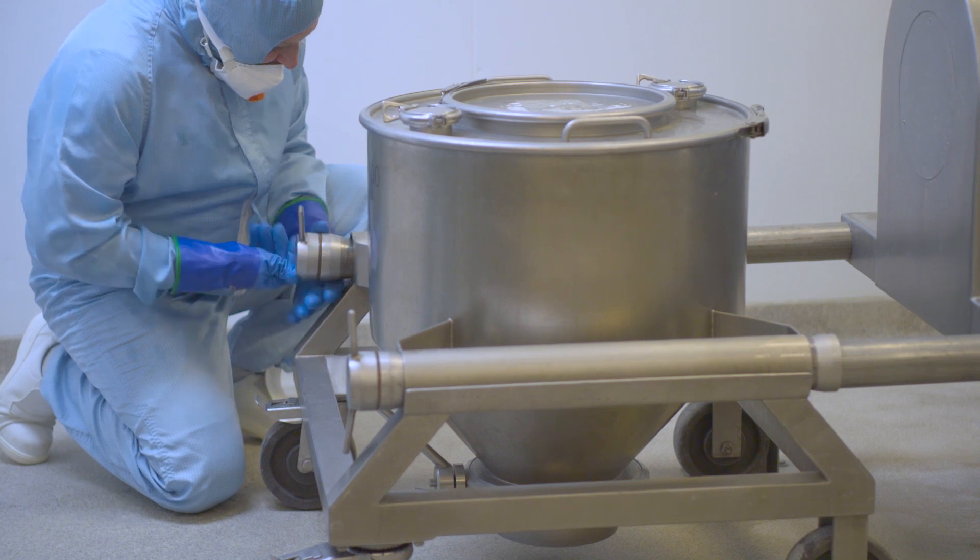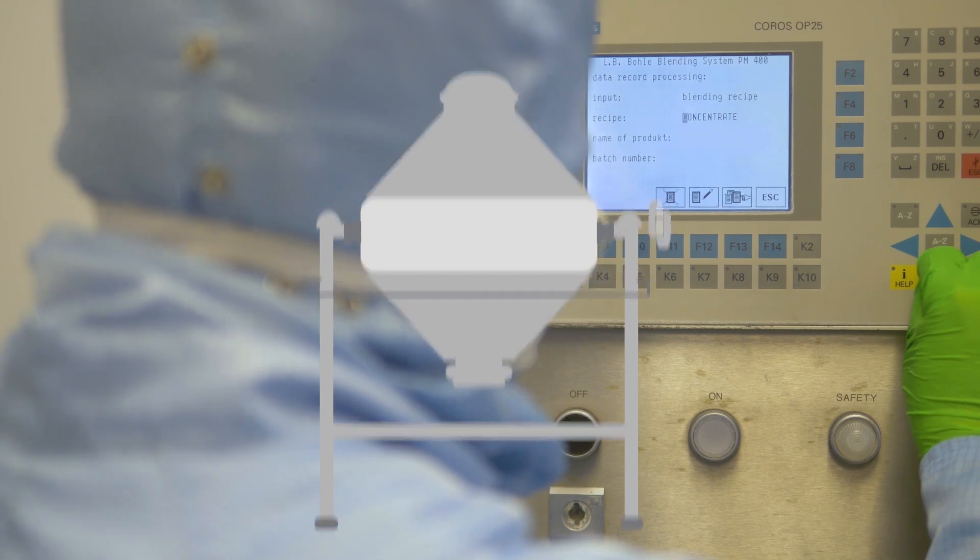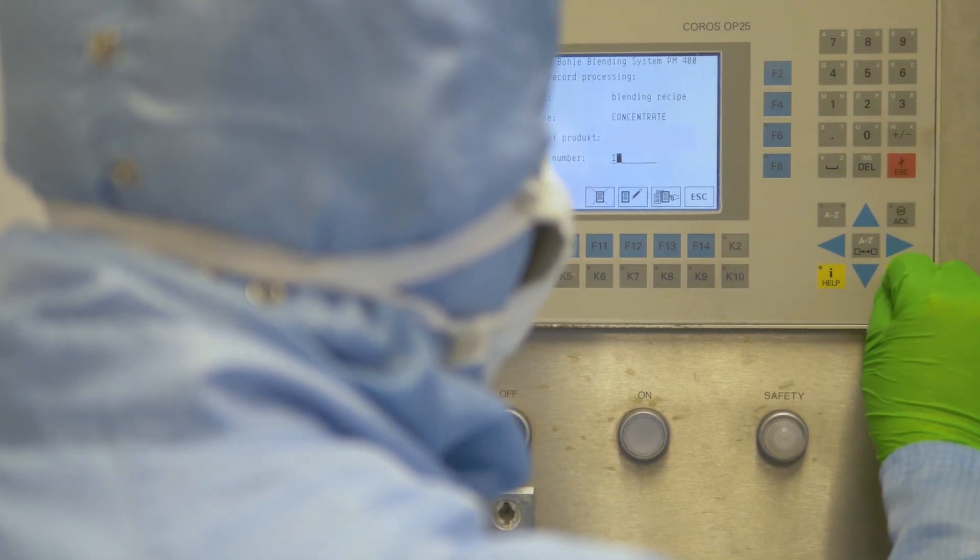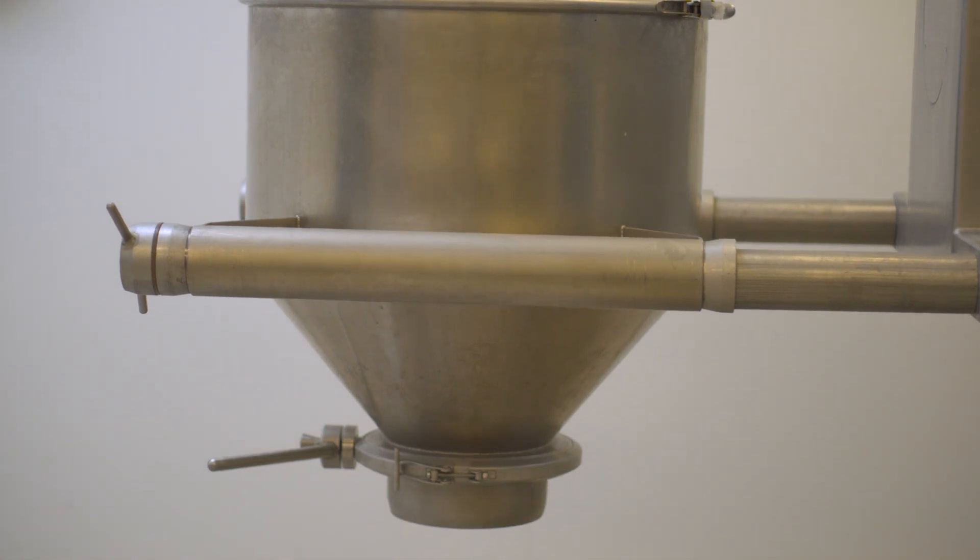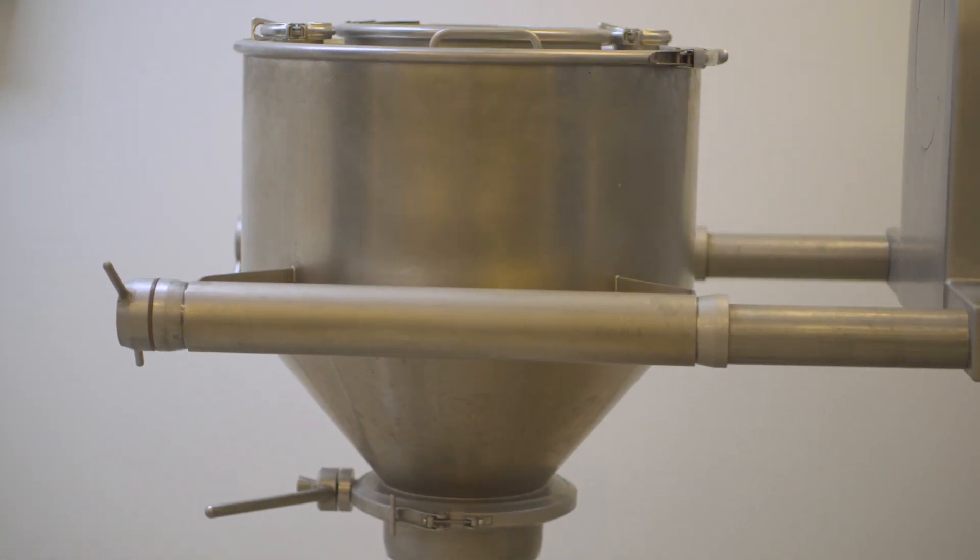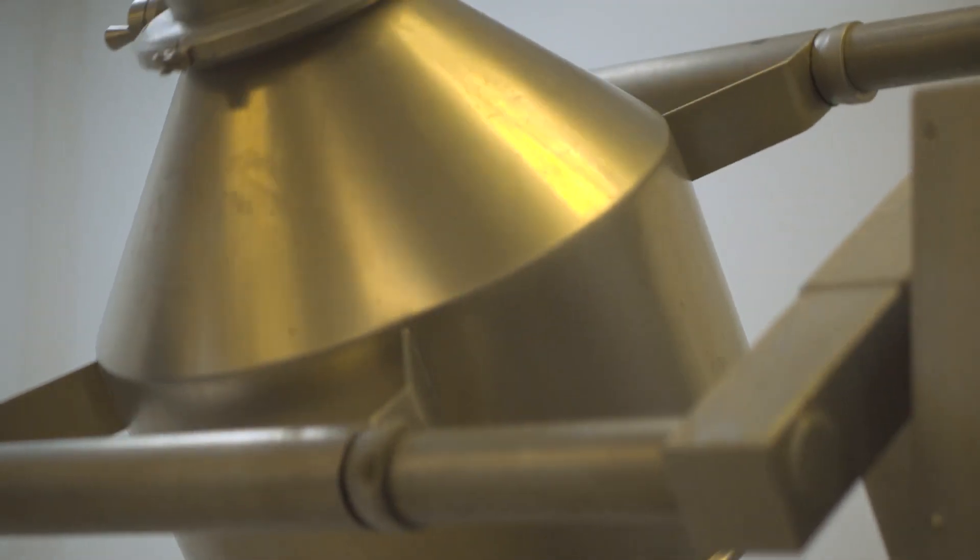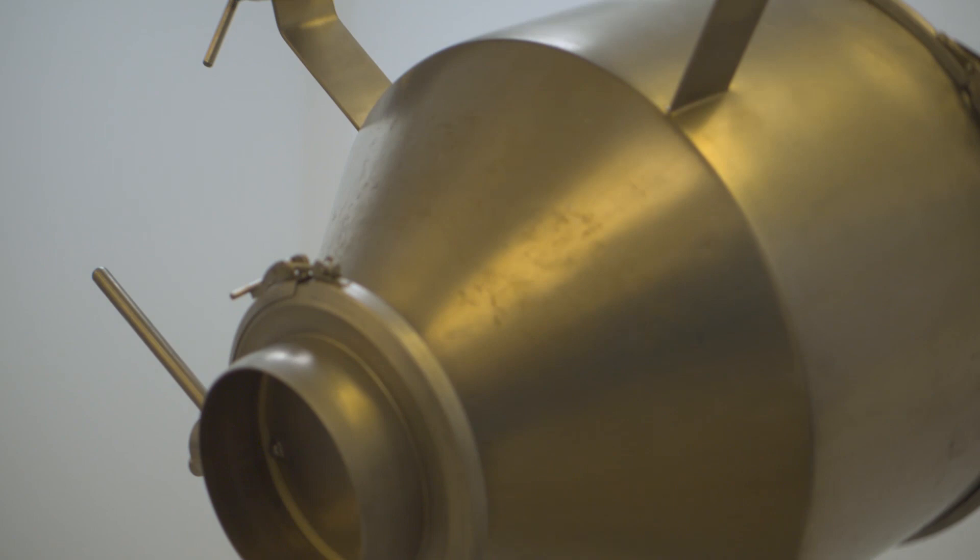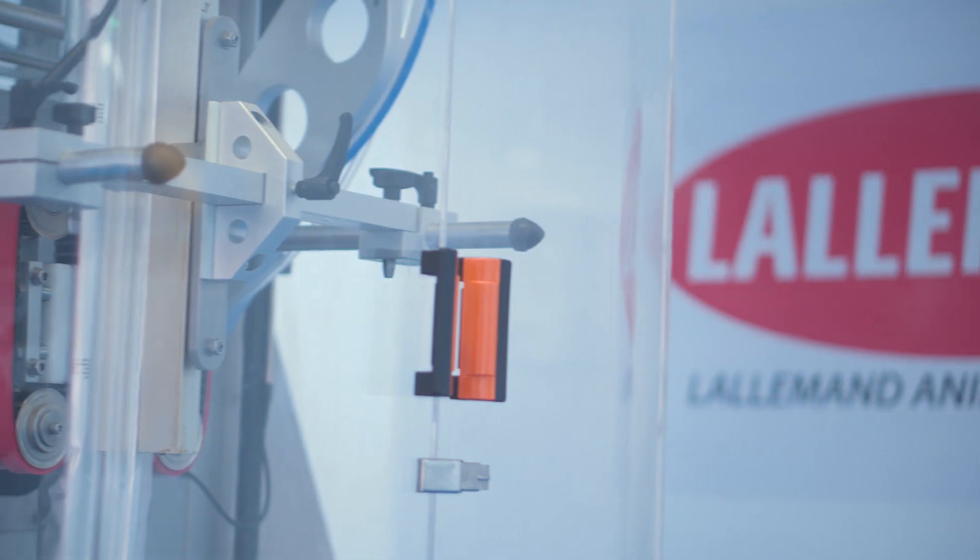This is a blending drum where we add to the bacterial powder and other raw materials to make the final formulated product. These include bacterial powders, enzymes, flow enhancers, moisture scavengers, and various other components. The drum is designed to rotate at speeds required to make sure all the powders are universally mixed without harming the bacteria.